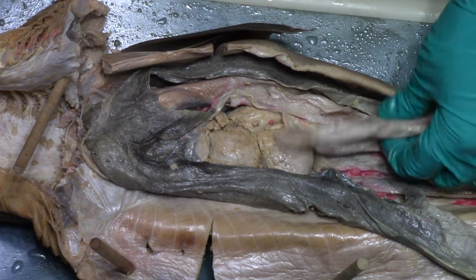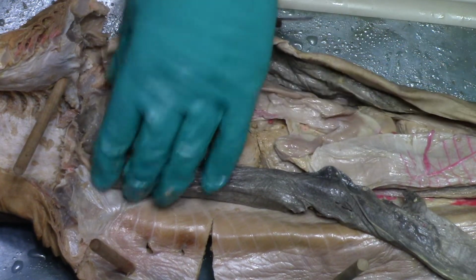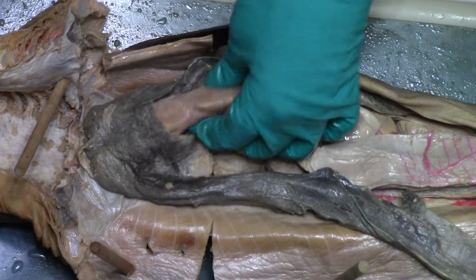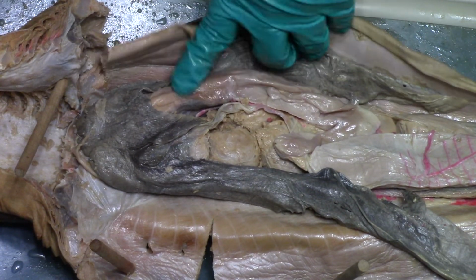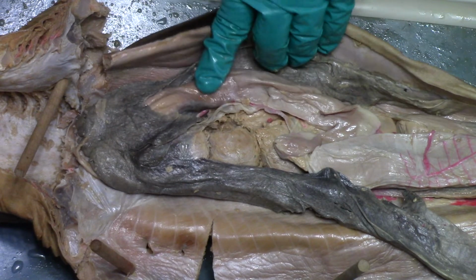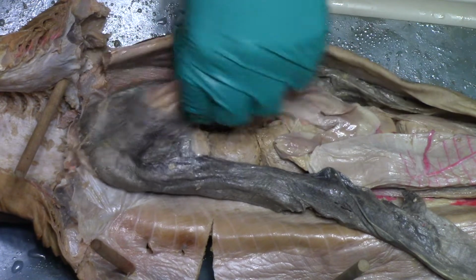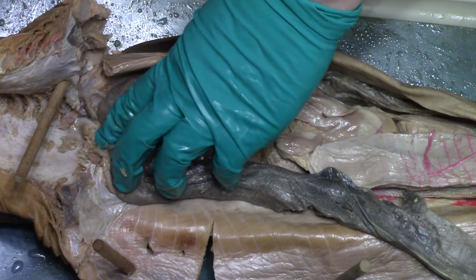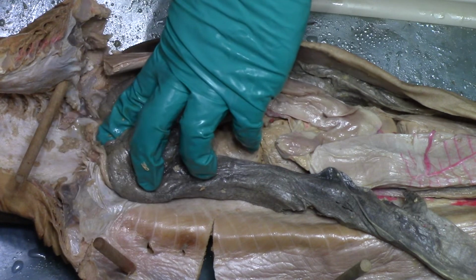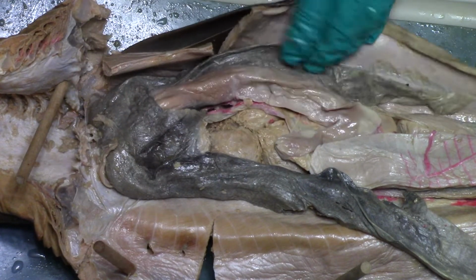And then this is part of the stomach here. So this is the esophagus, the main stomach. So esophagus and main stomach are about the same width. It has a very wide esophagus, and that's the part that's up here with all those hairs. I'll cut that open so you can see all those hairs a little bit better. They're full of papillae to help move food down.